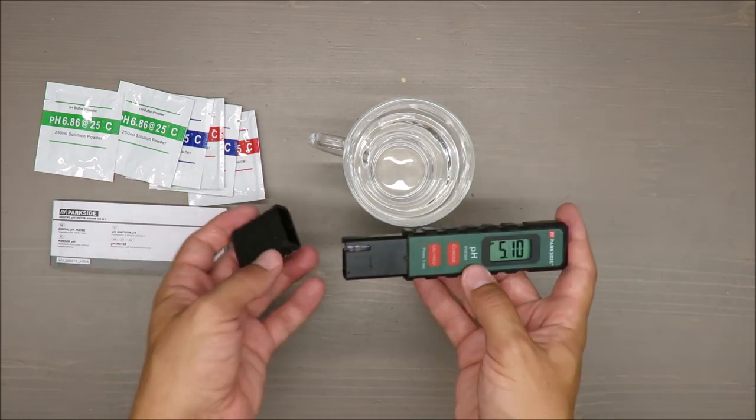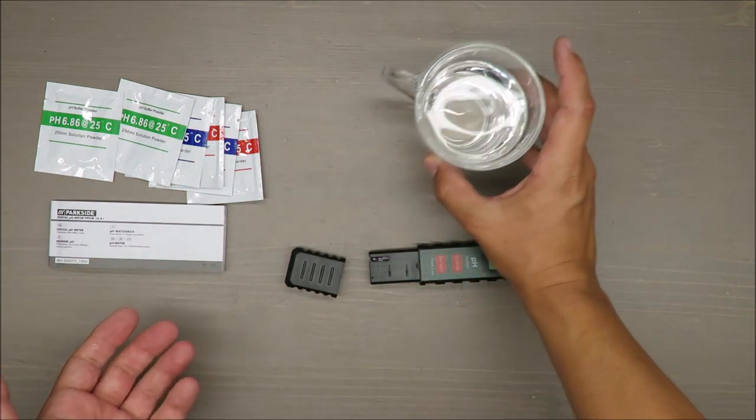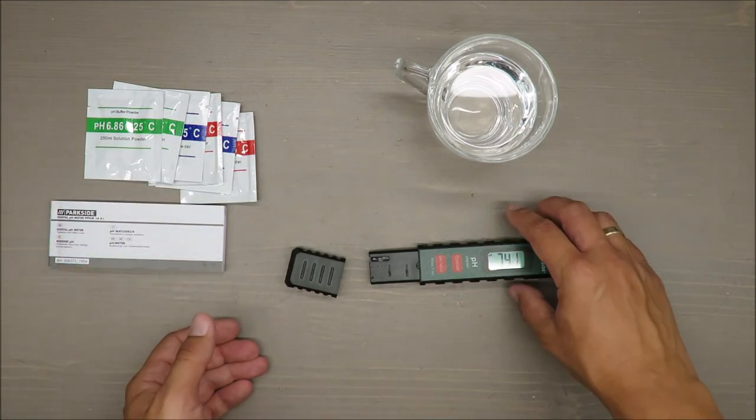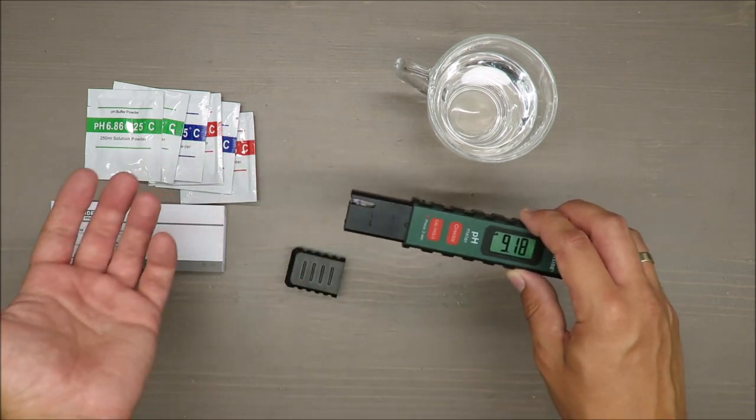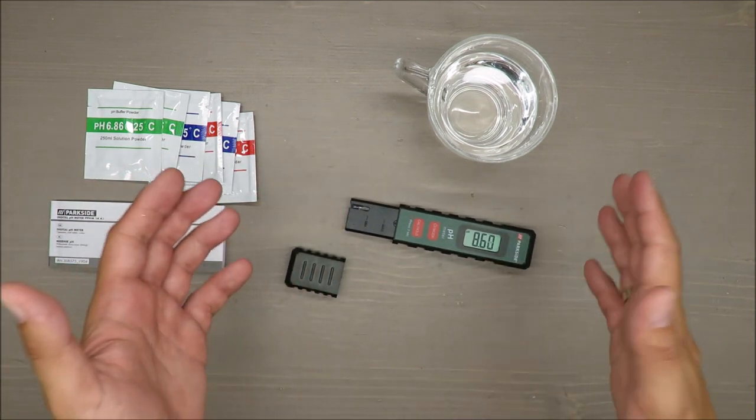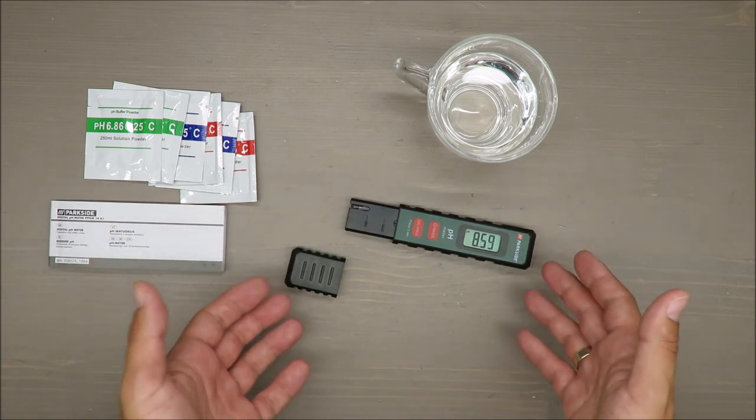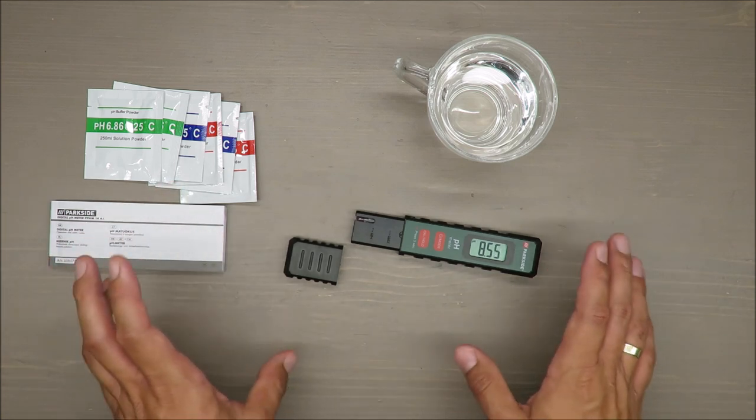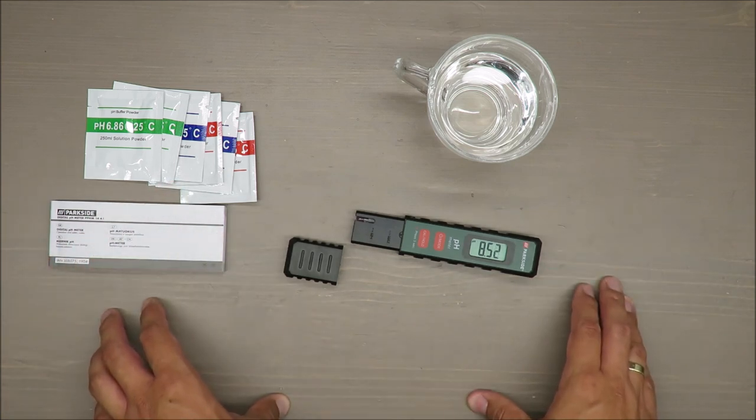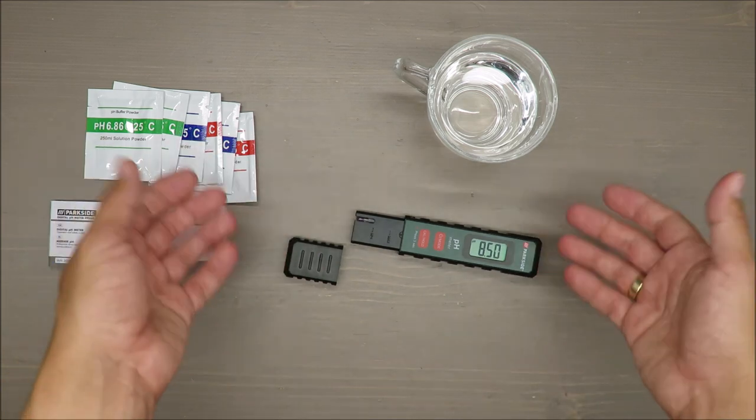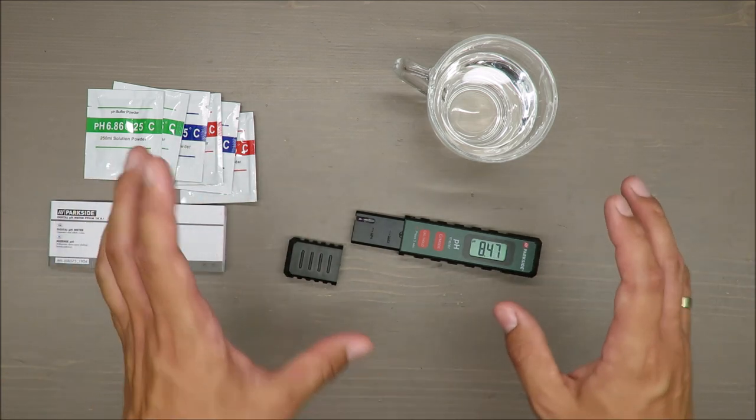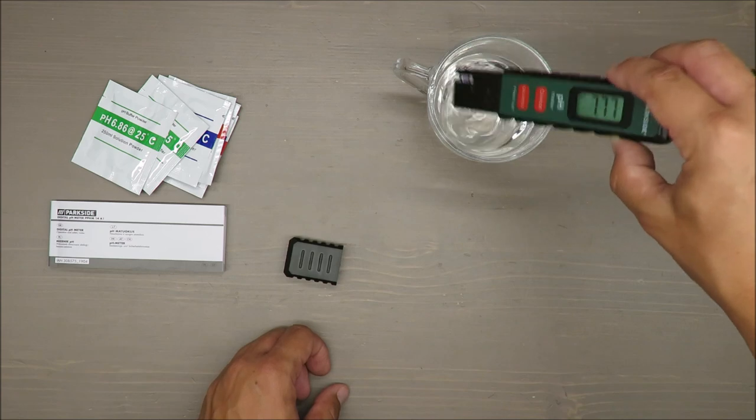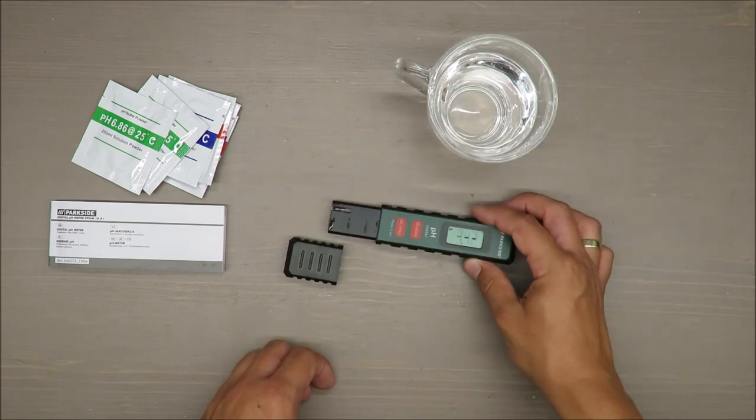What for? You won't check your coffee acidity, maybe? Really, please share with me your thoughts for which purpose, for which intention it has been made, because I cannot find any practical reason to buy it for your regular daily life. Maybe as a thermometer, but really I don't think so.